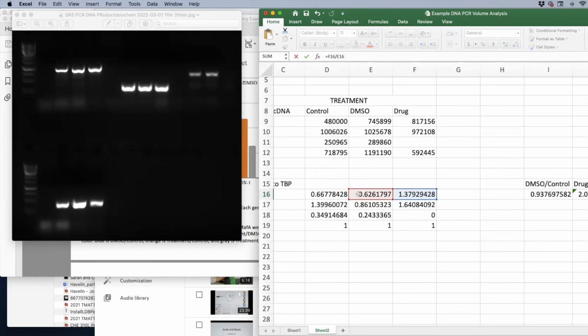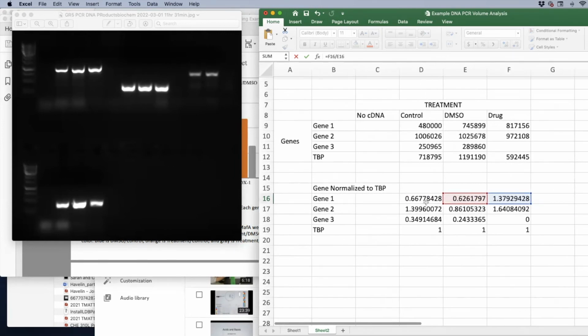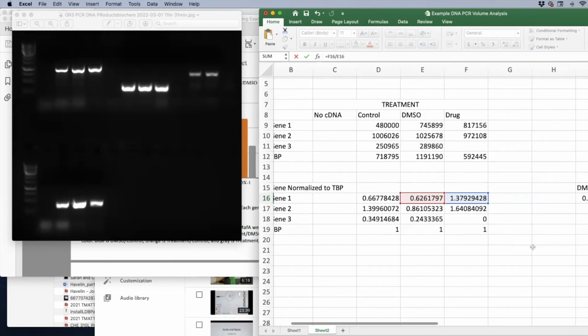Yeah, that doesn't really change anything if the control's gone. Well, if it was phthalates, you could at least normalize to DMSO. Technically you should. I'm not going to make you. You can still technically report the ratio to TBP. That says something. If the ratio changes, technically you could compare. No, you don't have control. We'll just redo it. I'll email you.